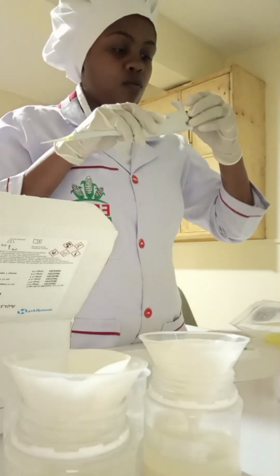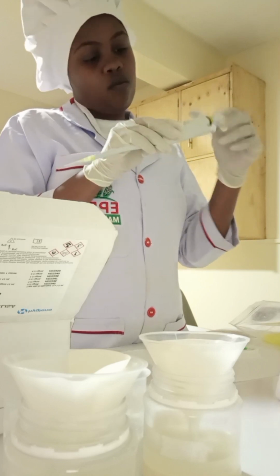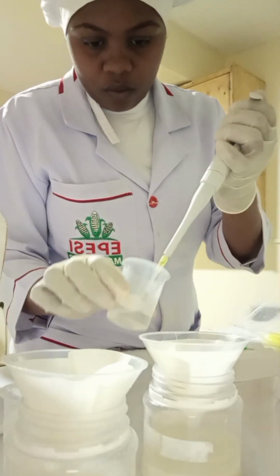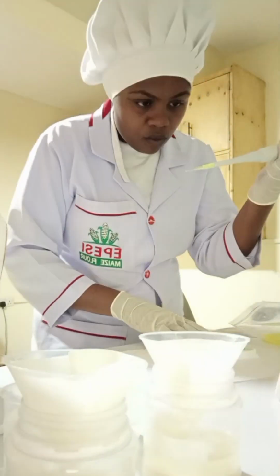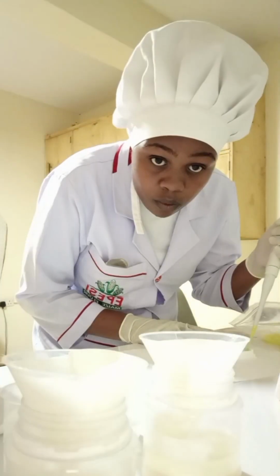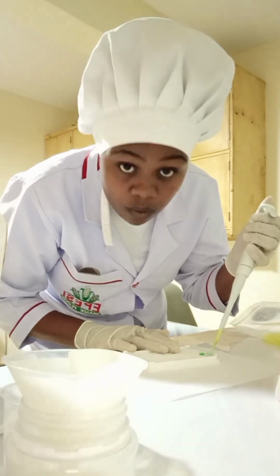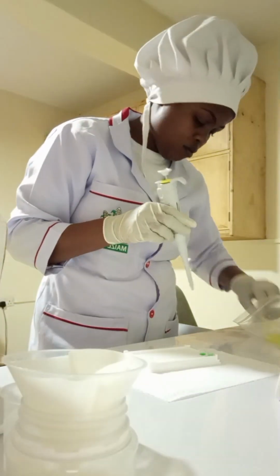Now next step is you take a pipette tip, uende kwa sample A. You go to sample A very fast. Now this one you also adjust the mls unafaa utumie ya sample, hazikwangi same. So sample A iende kwa well A, you do the mixing, uharakishe. This process inahitaji mtu wako very fast. Yeah, time inaenda na masaa.